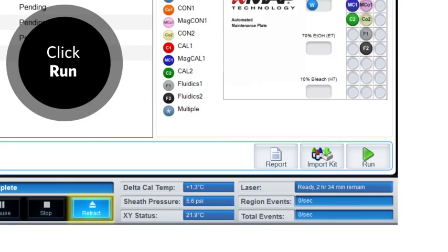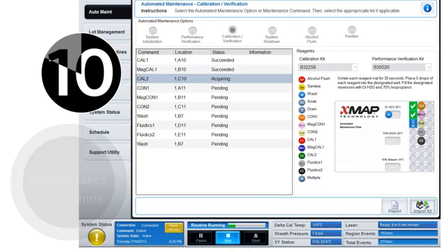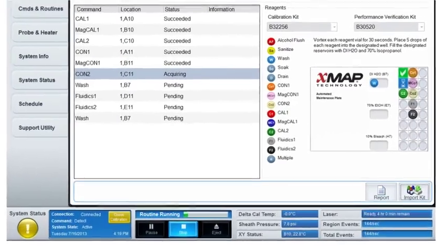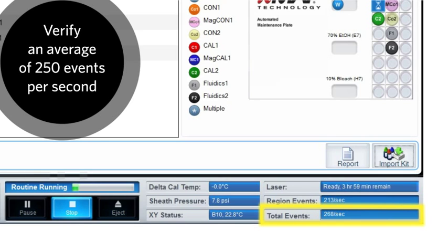Invert the vial and place five drops into the designated wells. Repeat for each reagent. Fill the DIH2O D7 well three-quarters full with deionized water. Click Retract. Click Run. The calibration and verification routine takes about 10 to 15 minutes to complete. While the calibration and verification is running, monitor the events per second being displayed. It should peak above 250 events — verify that you are getting an average of 250 events per second.